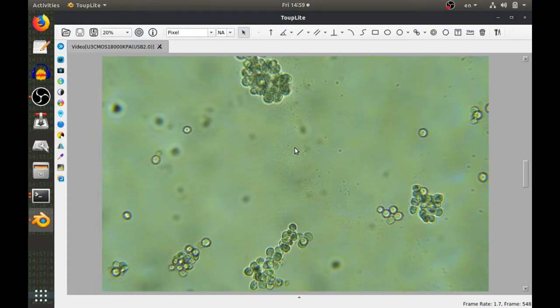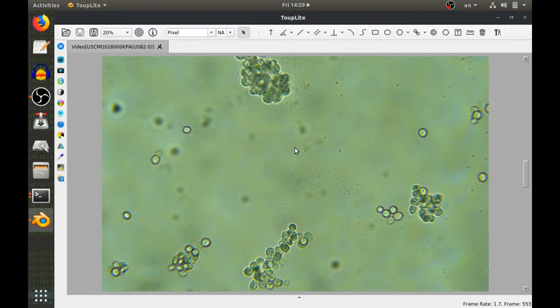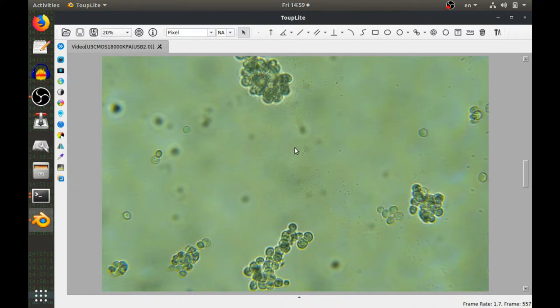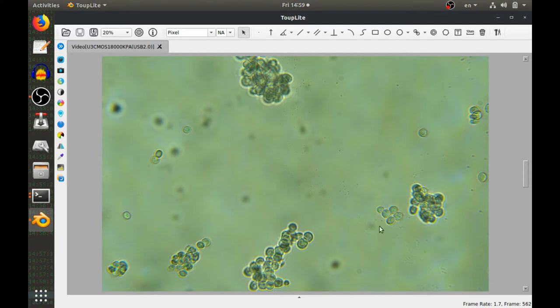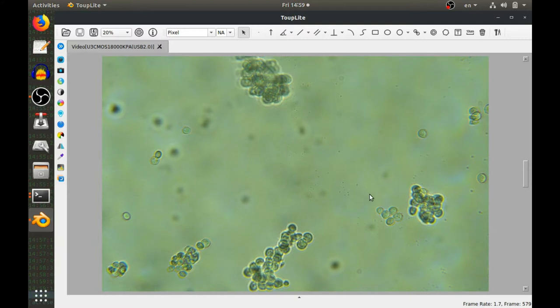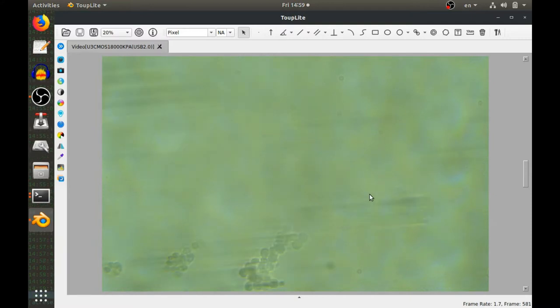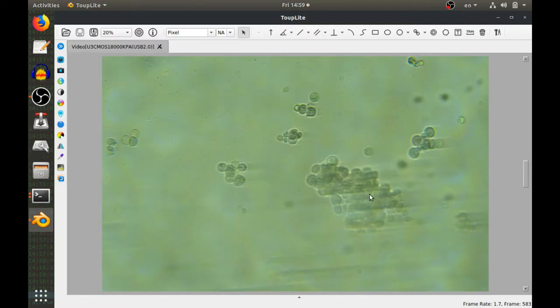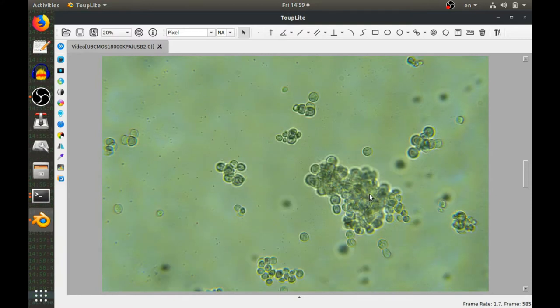You can see some of the yeast cells here. I fed them sugar last night. I think they finished it all, otherwise I was hoping to see some carbon dioxide being produced. These are just normal brewer's yeast, the ones you get from the supermarket that you use to make bread or cakes and so on.